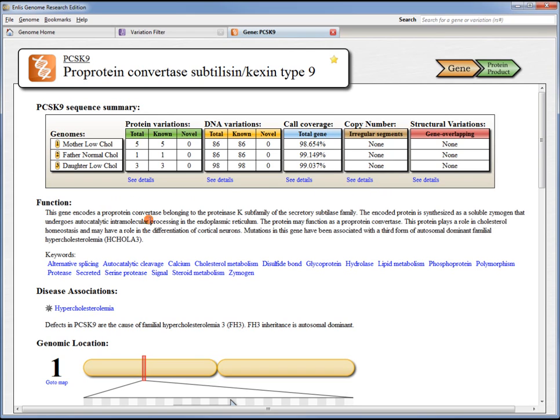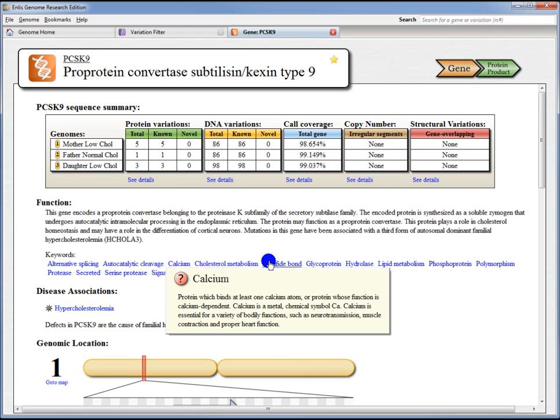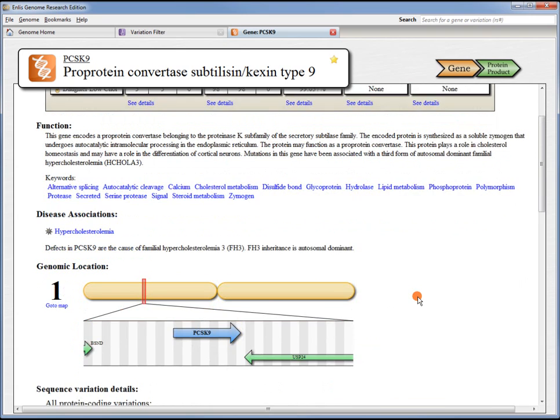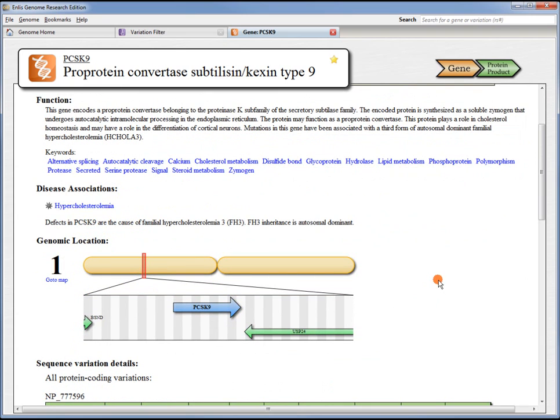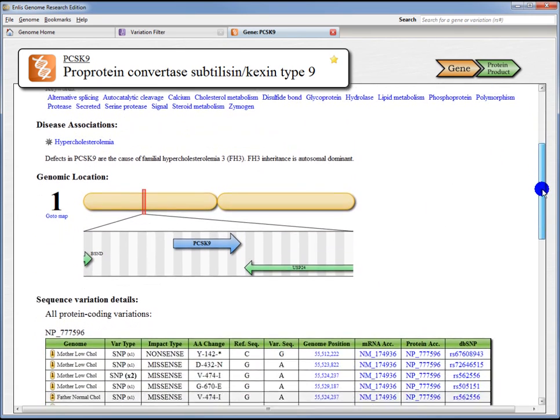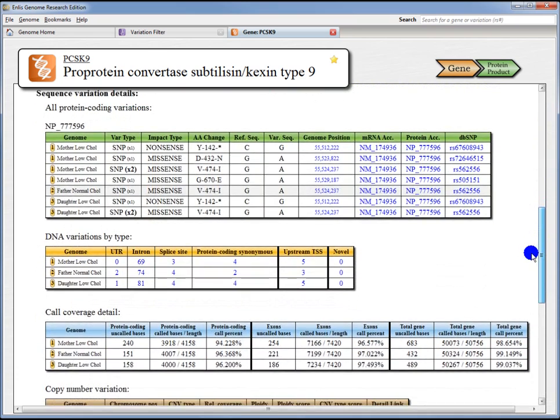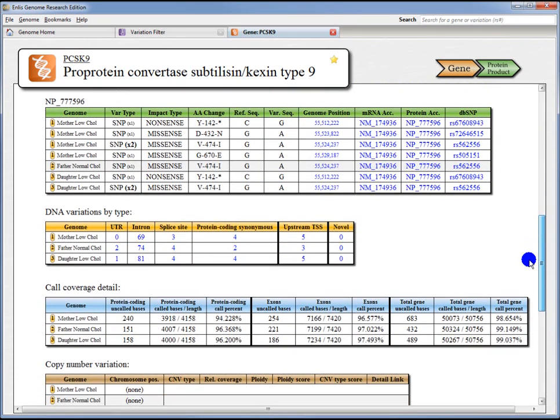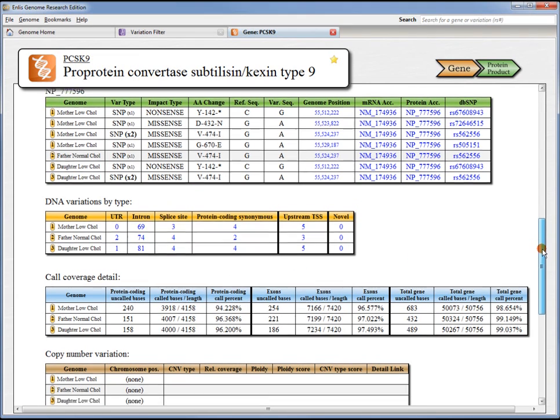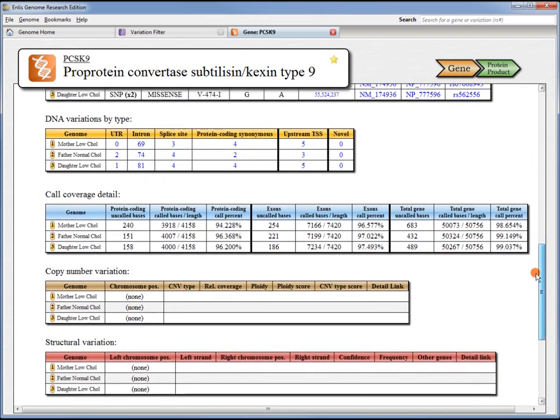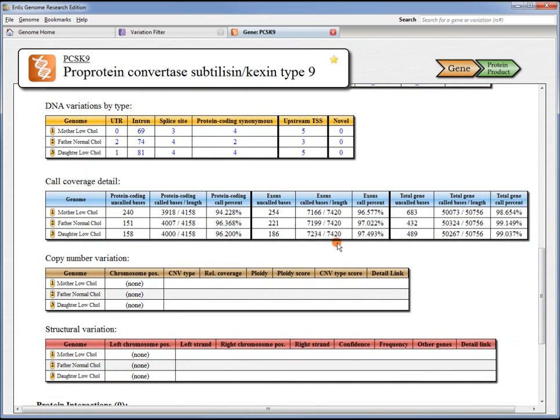We can read about its functional description, get keywords with definitions, any disease associations with this gene are noted, and we can get a broad overview map of where this is in the genome. As we go down further on the page, we start to get into some of those details. We can see the specific amino acid changes that occur. We can see the types of DNA variation, UTR or intron, and have links to go directly to those lists. We get call coverage details broken down by protein coding bases only, or exons, or the total gene.